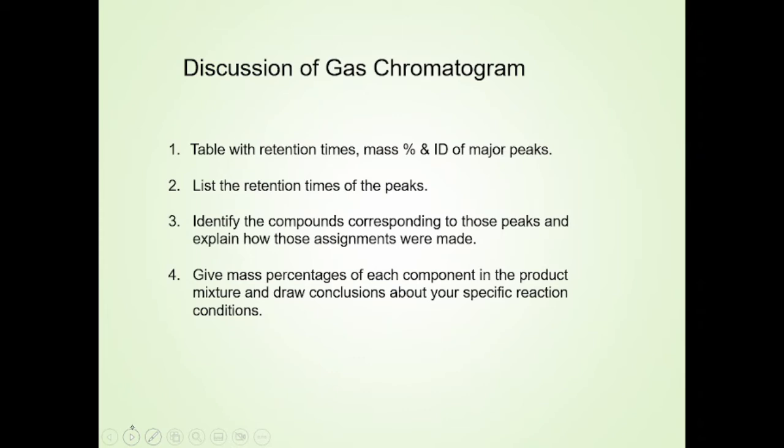In fact, as far as the discussion for the mass spectrum, you do not need to discuss any of the mass spectra other than the alkenes. I don't need any discussion about the aldehyde or the triphenylphosphine oxide. You can ignore those. Those are other things. All we're trying to do is identify the product or the products we're interested in.